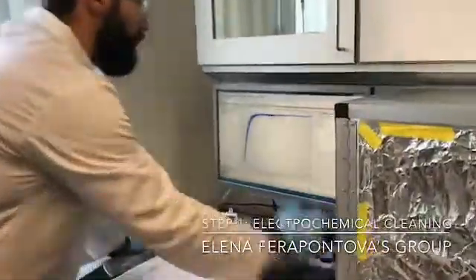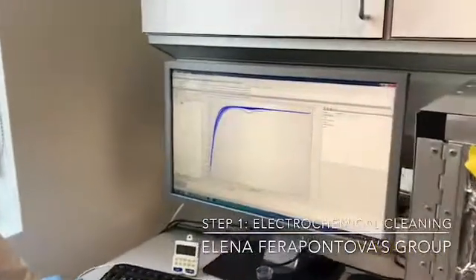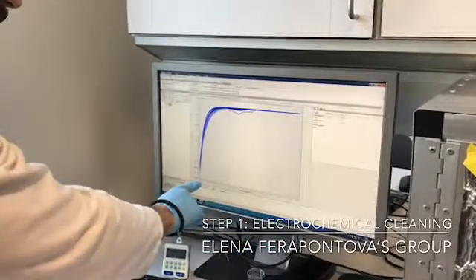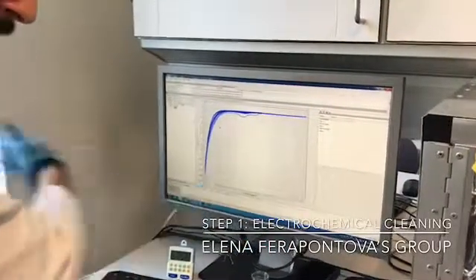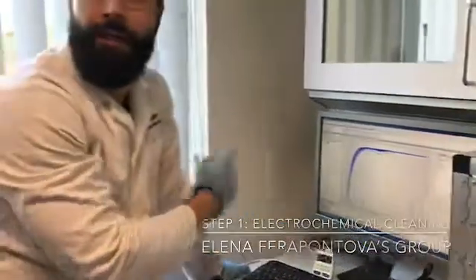Next, you run cyclic voltammograms — 10 cycles starting from 0.4 volts all the way to minus 1.6 volts. And the scan rate is 50 millivolts per second. And that's step number one.